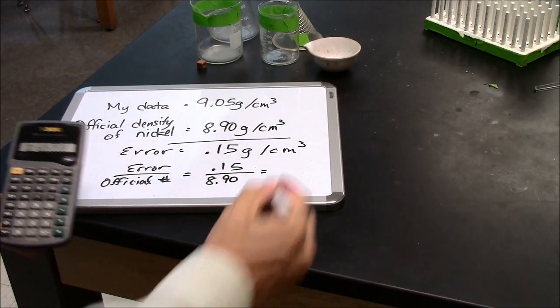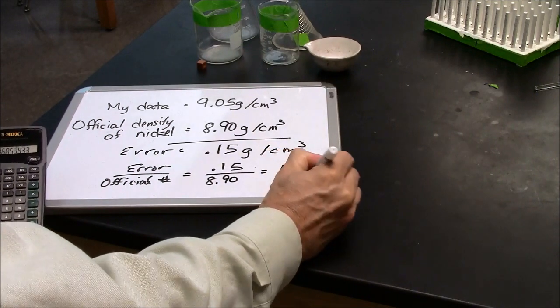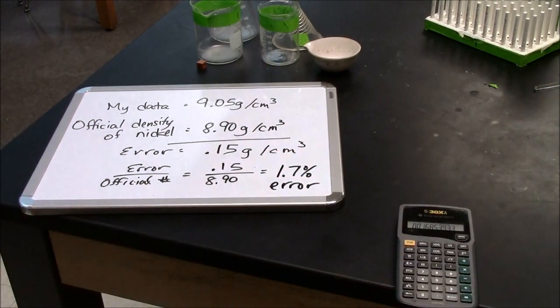And I have a 1.7% error. So that means I did pretty well. My methods were accurate.